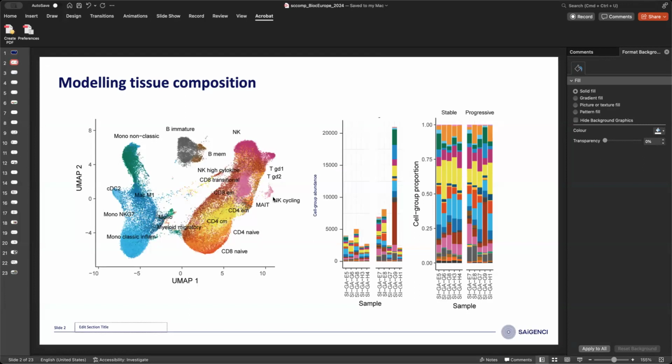So, of course, I assume we all know what compositional data is from single cell, but just to reiterate, it's pretty easy. Of course, we assume that the clusters are given in this case, and once you define the cluster for many samples, you have here in the middle, you can count the cells for each cluster, yeah?